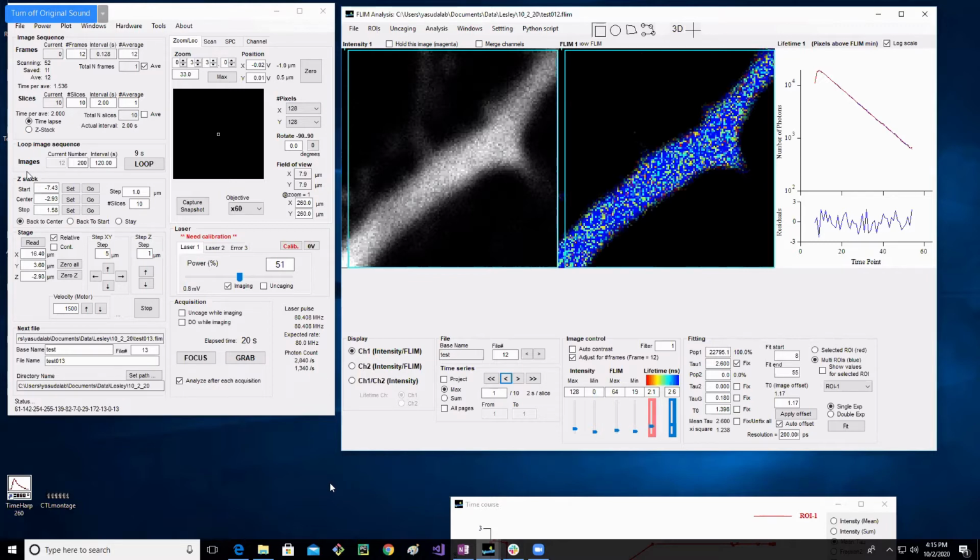Okay, so see how these are sort of embedded inside each other? You have frames as your first thing that you can manipulate, and then you can manipulate your frame sets into slices, and then you can manipulate your slice sets into images, okay? And so this gives you a tremendous amount of variability if you want to build complex imaging protocols. Typically, we don't do super complex things.